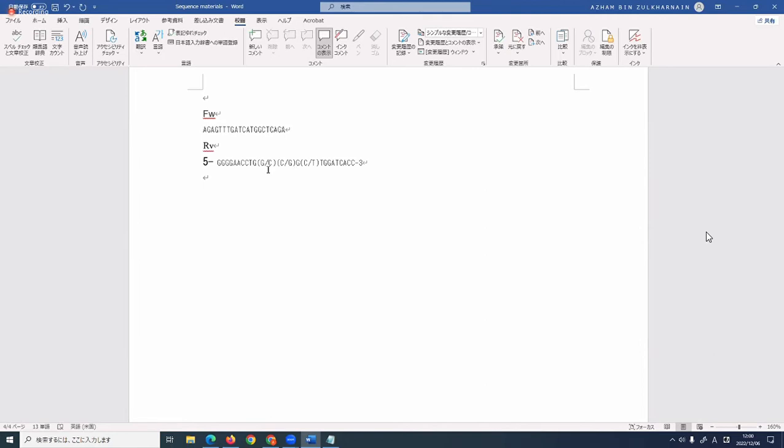Of course, you'll do your reverse complement afterwards, which technically means, all right, we did hard work doing this, but you can ask the company to sequence. You can design basically 2 primers for the back, all right? So the one with the G version or the C version or the T version, and the company can synthesize a combination of G and C at this location so that it works with both different types of DNA. So we have that.